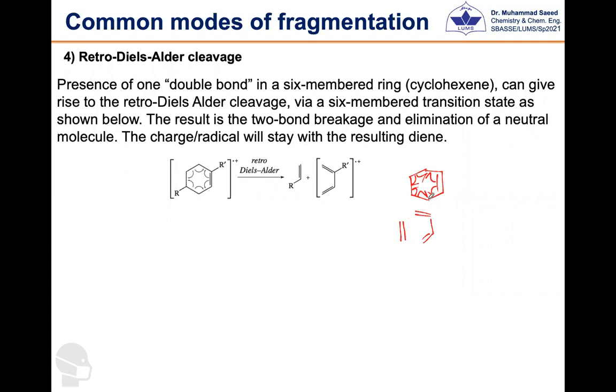So that is the retro-Diels-Alder mechanism.